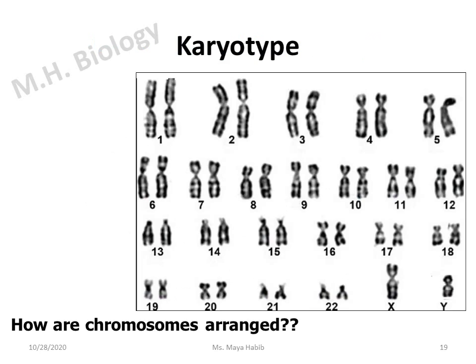After completing the karyotype arrangement, let us look at how the arrangement was done, and I mean according to what criteria the chromosomes are arranged. As you can see in this figure, the chromosomes are arranged in pairs, but why do we arrange them in pairs? Of course, because in this case we are working with human white blood cells, and these are diploid cells having 2 copies of each chromosome type.